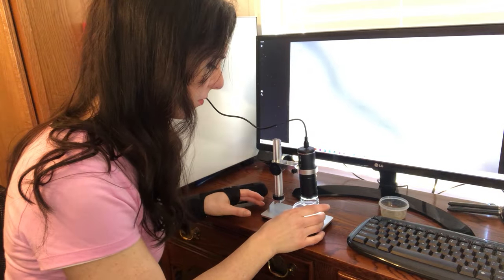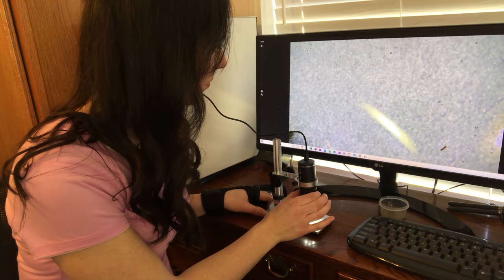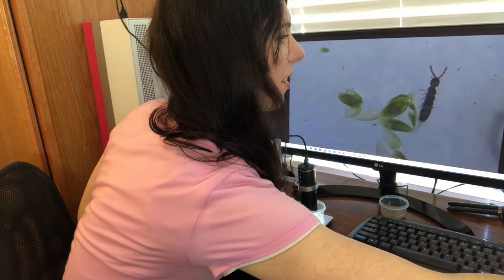I don't have to strain my eyes because it connects to my phone and computer. I use the dials on the microscope to zoom and focus. It even takes pictures and video!